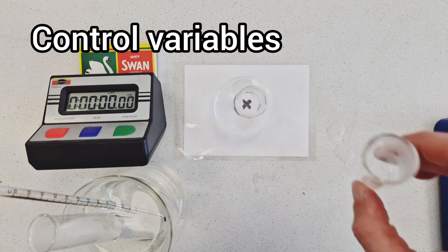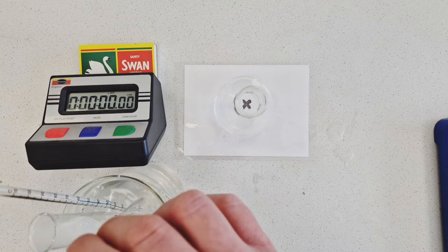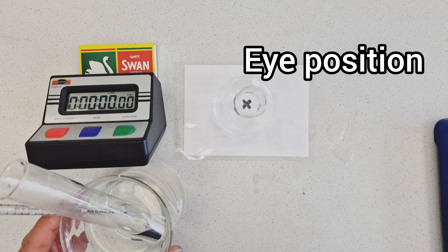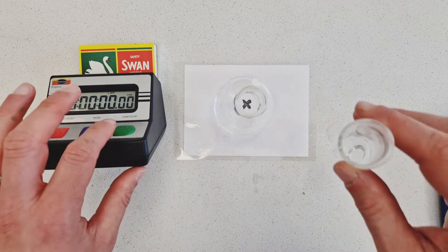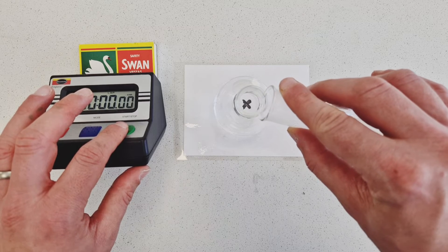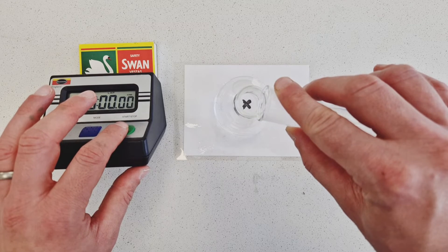At this point, it's worth stressing there are lots of controlled variables going on in this experiment. The volume of the solutions will be the same, the concentration of the solutions will be the same, my eye position will be the same, and finally, the speed of swirling of the conical flask will ideally be as close to the original as possible to make sure we have what is known as a fair test.